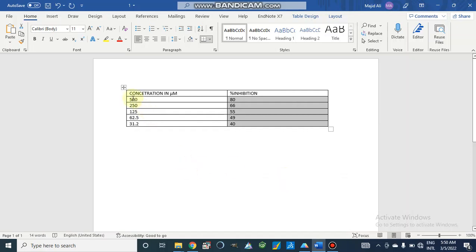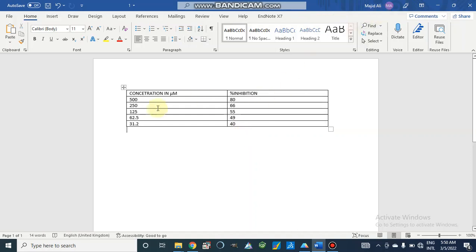Let's suppose we have concentrations at different levels and we have percentage inhibition. So these are the in vitro calculated values.